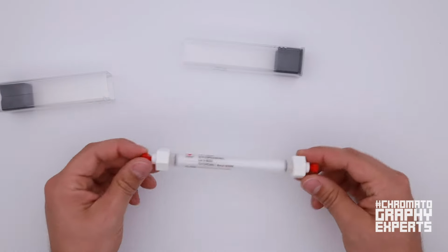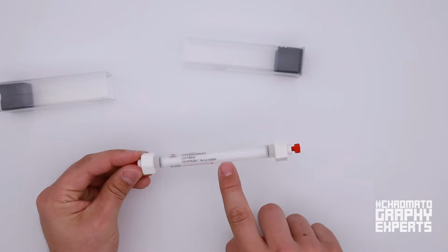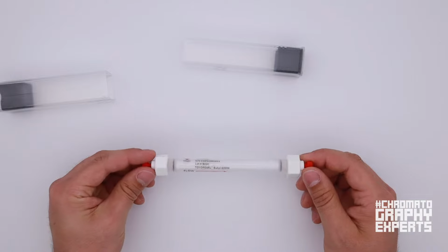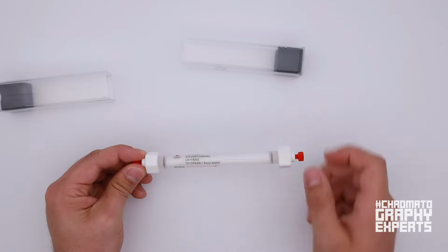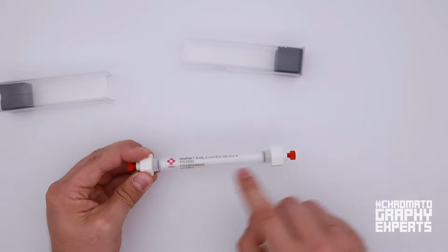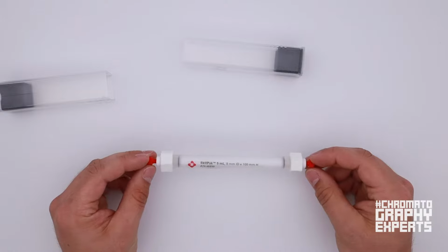And the column itself, as you can see here, again has the label, it shows the flow direction, and it also gives you all the necessary information that you need to put into your lab journal. So again, the resin that you're using, the lot of the resin, the serial number, so it contains all the necessary information that you require.